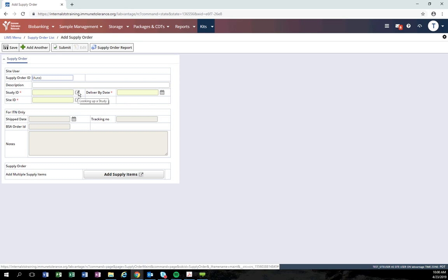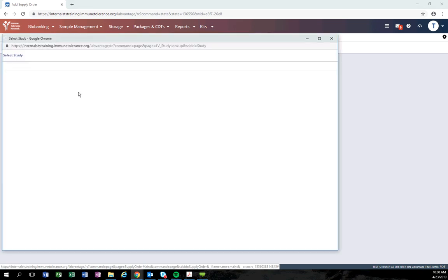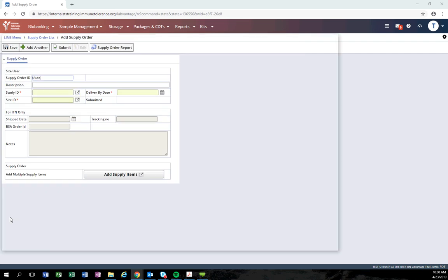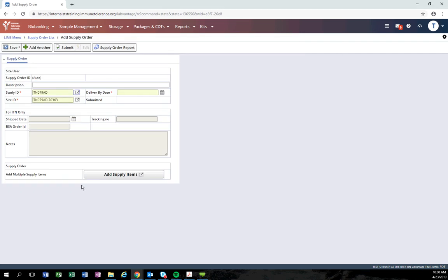The system will automatically pre-populate the site ID. If the system does not pre-populate the site ID, this means you do not have access to this study. Please contact your column immediately if you believe you need access. If you selected the wrong study, click the select button again to select the right study.